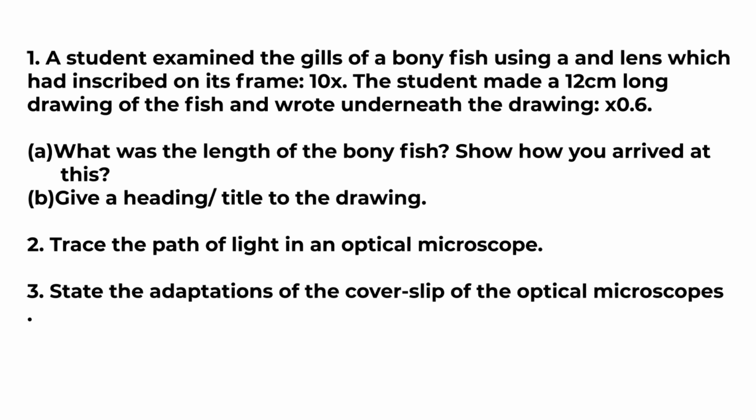Question 2. Trace the path of light in the optical microscope. Question 3. State the adaptations of the cover slip of the optical microscope.